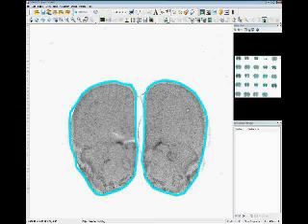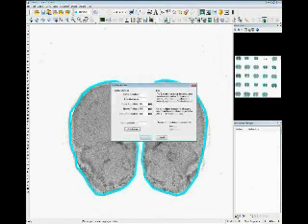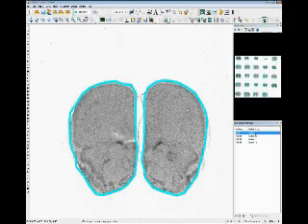There's a couple other things I'd like to show at this time. I wanted to show you how you can link regions in your image to the serial sections in Serial Section Manager. And so this is a good example because we have a number of physical sections here that represent this virtual slide image. So I'm going to start the Serial Section Manager. And I'll just, for demonstration purposes, say we've got 4 sections. And they're 20 microns apart. So now the serial sections have been generated for me.